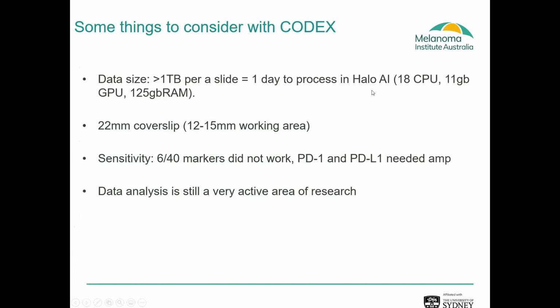And when we've been using the Halo AI system to tissue segment and cell segment, one image has been taking about 1 day. So with 18 CPU, 11 gigabyte GPU, it's taking a day to process a single slide. So it is large data.